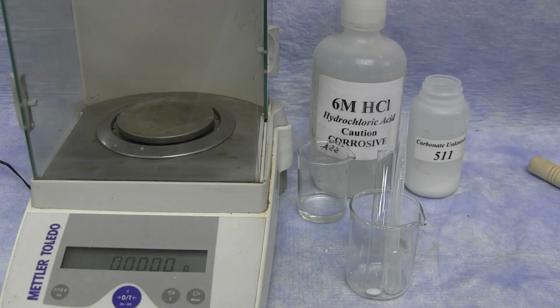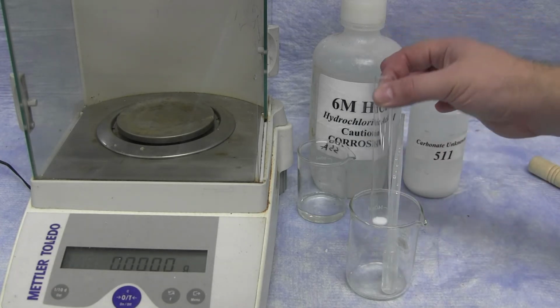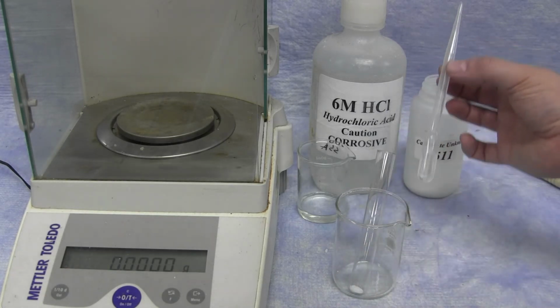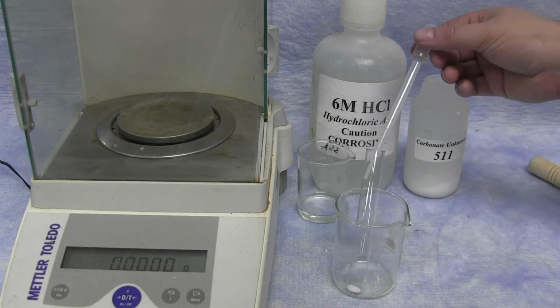And the total mass of the sample itself can be obtained by the difference between these two measurements. In this case, the mass of the sample itself, the mass of the powder, is 0.3056 grams. After which, you can take the acid and add that slowly to the test tube.